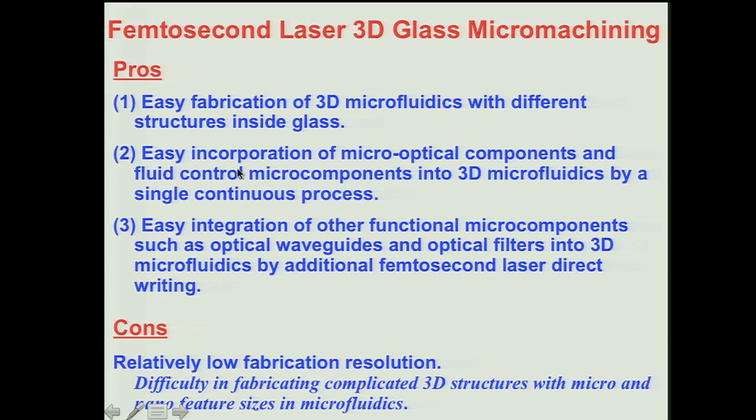And also easy incorporation of the micro-optical components and the functional fluid control microcomponents into the three-dimensional glass microfluidics by a single continuous process. Furthermore, easy integration of the other functional microcomponents, such as the optical waveguides and the optical filters, into the three-dimensional microfluidics by additional femtosecond laser direct writing.